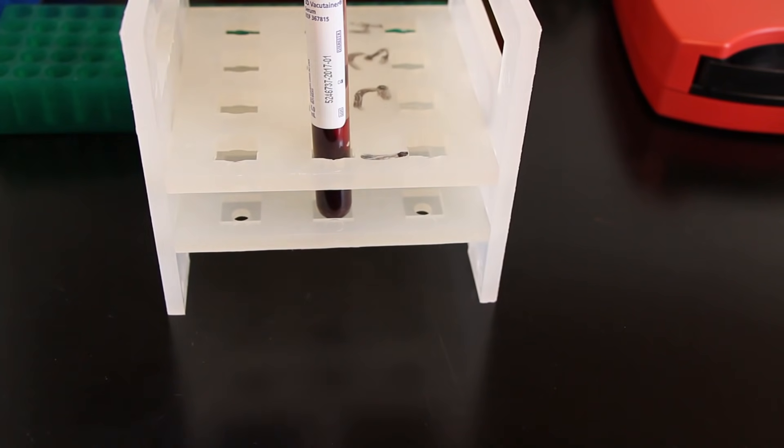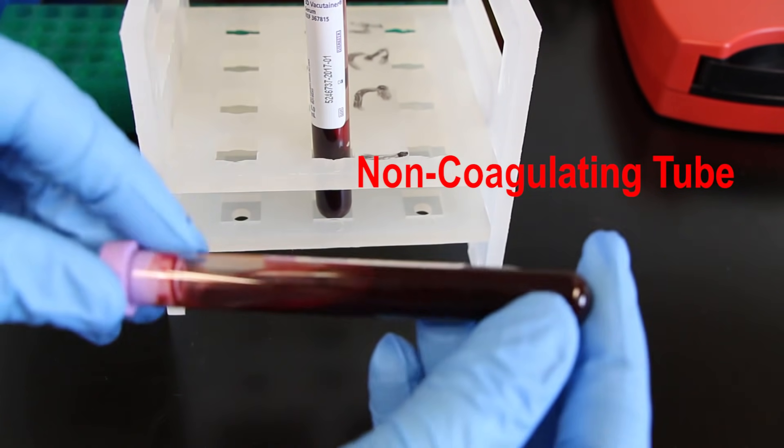Then you're going to take the blood and you're going to set it upright in a tube holder and allow the blood to clot if it is a coagulating tube, or you can spin it right away if it's a non-coagulating tube.